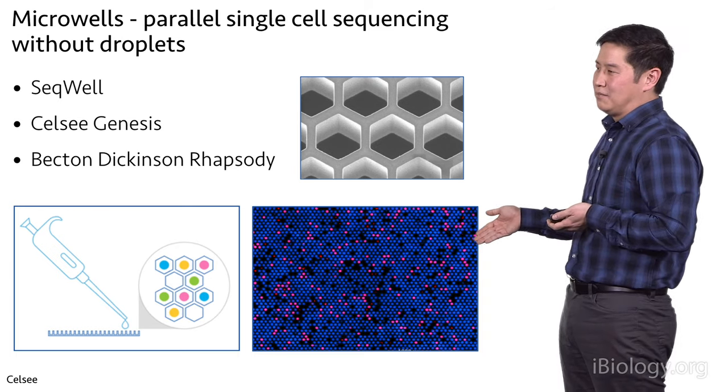So in conclusion, there are actually many different types of single-cell sequencing. I've only focused on RNA today, but there's DNA, there's protein, there's chromatin accessibility, and many, many new methods coming out every few weeks. So it's an exciting field to be in. Single-cell sequencing also generates high-dimensional data, especially if you're looking at RNA, because you're probing the expression level of all 20,000 different genes that can be expressed in cells. And so this can reveal biology that's hidden from lower-dimensional techniques.